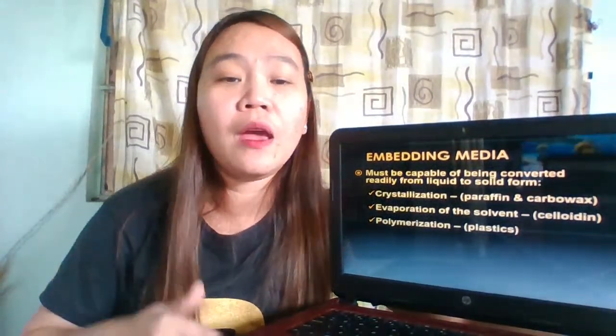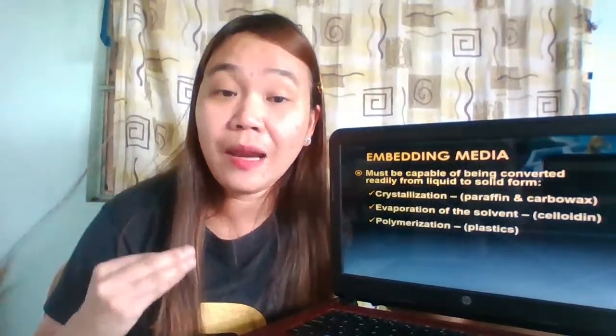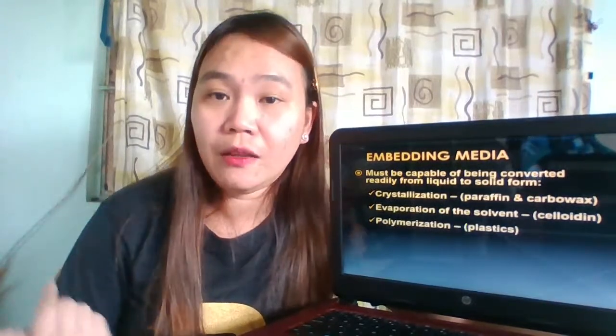It should be convertible from liquid to solid form.